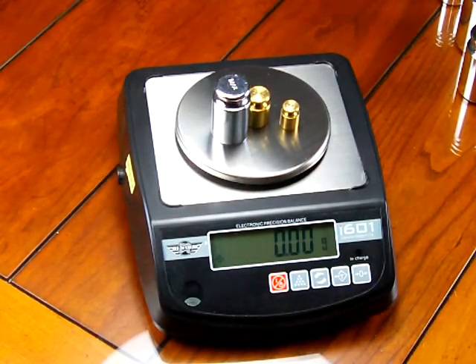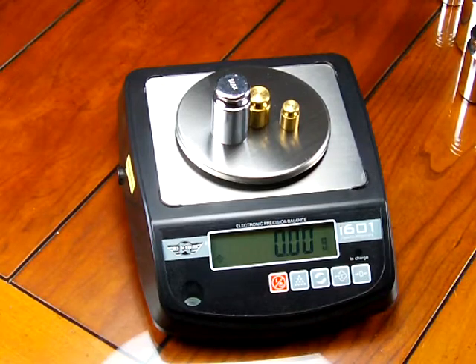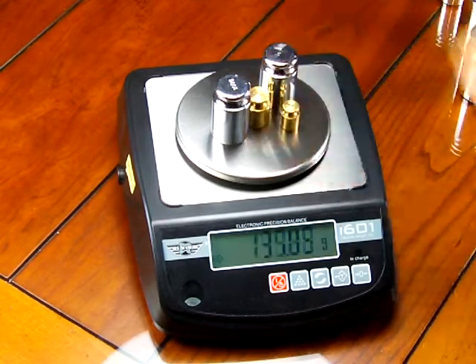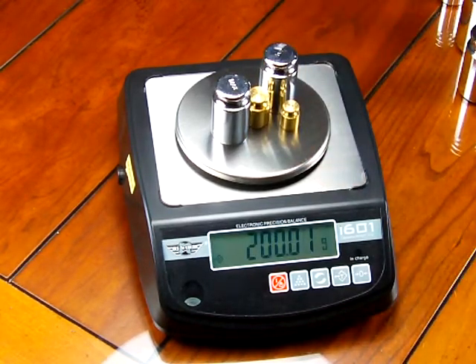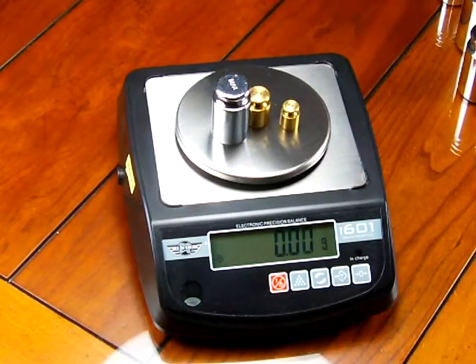It used to have a weight guide on the side. This display does not. So you have to really watch what you're putting on for weight so that you don't exceed the weight capacity. So here's another 200 grams.